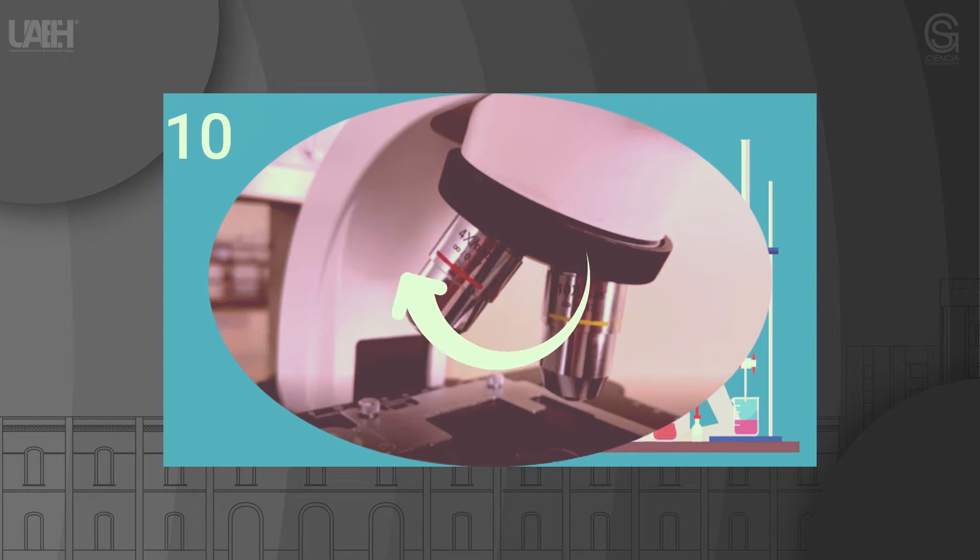Step 10: From this point, if you want to observe the sample with a higher magnification, you can select the next objective using the revolver. A small adjustment of the fine adjustment screw may be necessary to maintain the focus. If you cannot focus the sample, you can repeat the procedure described from step 3 with the new objective.